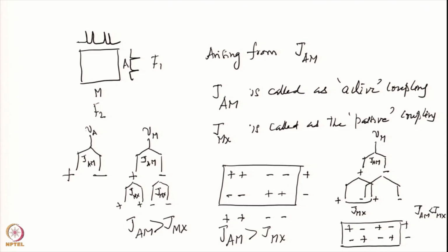Therefore it is very crucial to see what sort of a pattern you will get in the cross peak, and this will tell you what kind of precautions one should take in doing your experiments. So analysis of the spectra has to take care of all of these factors when you want to measure the coupling constants from the COSY spectra, and this is true for both COSY as well as double quantum filtered COSY.